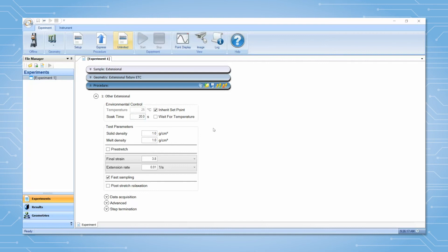The user should start with 20 seconds. The ETC camera is particularly useful for this purpose.